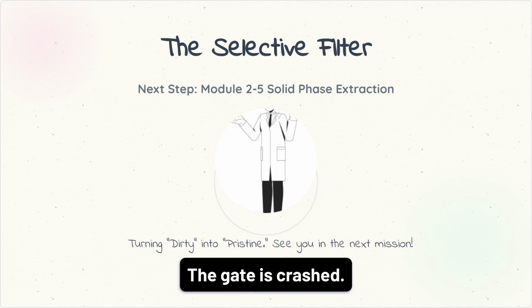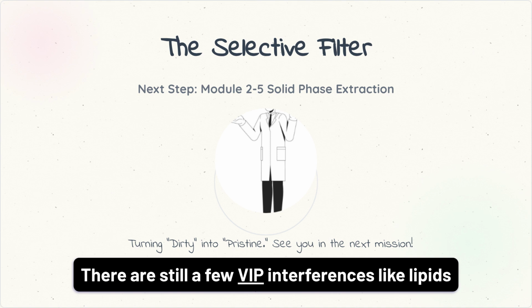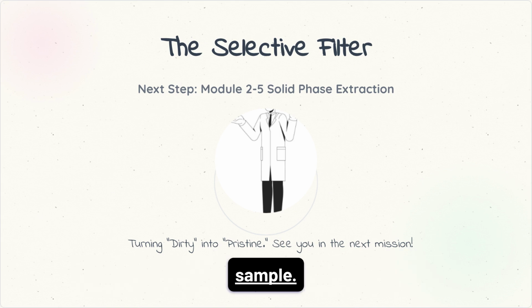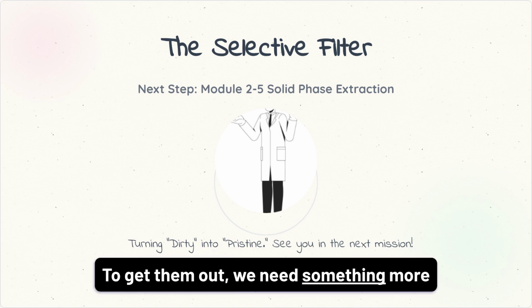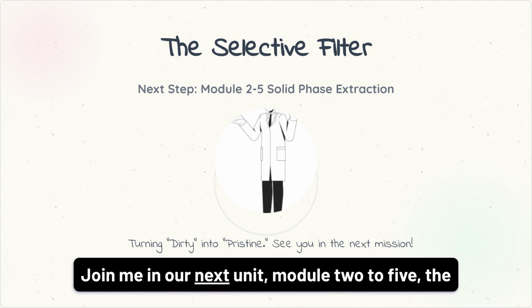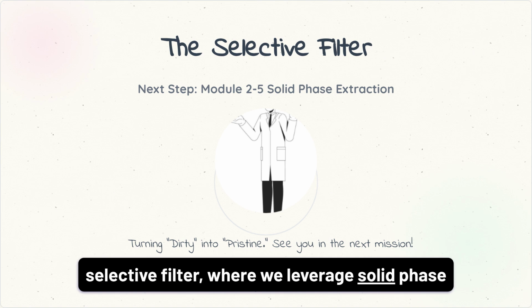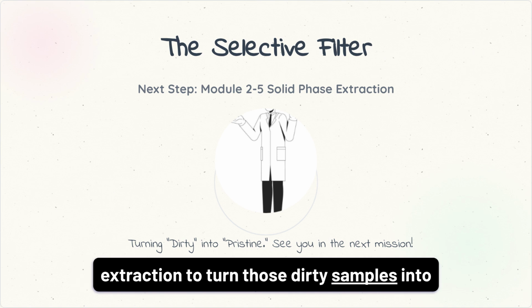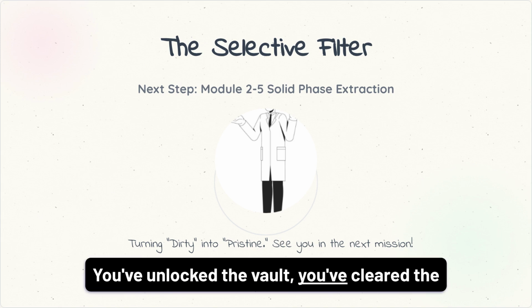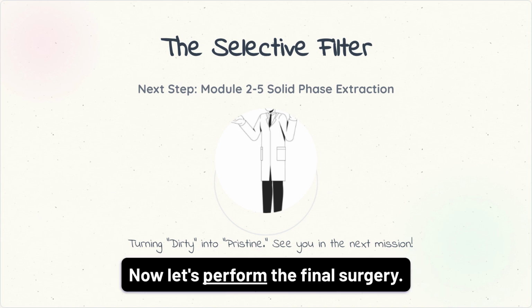The gate is crashed. The stadium is finally quiet. But look closely. There are still a few VIP interferences, like lipids and salts, that are hiding in the shadows of your sample. To get them out, we need something more surgical than a bulk crash. We need a selective filter. Join me in our next unit, Module 2-5, the selective filter, where we leverage solid phase extraction to turn those dirty samples into pristine, publication-ready data. You've unlocked the vault, you've cleared the bouncers. Now let's perform the final surgery.